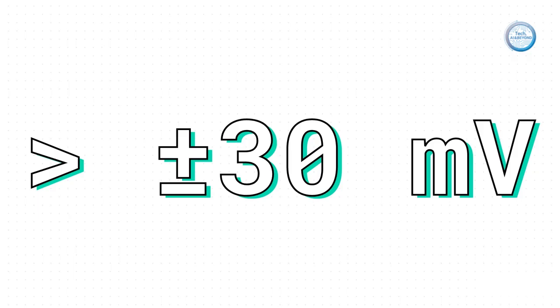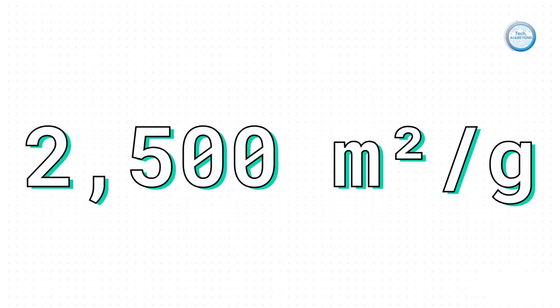If your zeta potential is close to 0, that's a huge red flag. It means your nanoparticles are probably going to aggregate and fall out of the solution, which could be a disaster for the application. So zeta potential is like an insurance policy for stability.